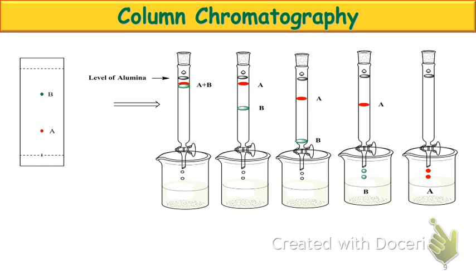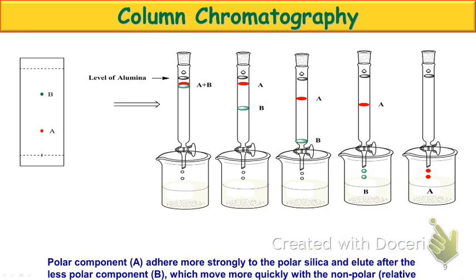So if we now switch this around and look at a time-lapse photography of what's going on with this. We've got our TLC plate on the left, and then we've got our columns going on to our right. What can you tell me about compound B? It is the least polar because it has, what about its RF? It's the highest RF. Okay, so it's going to be our least polar. So if we now go back to our column and try and track down what's happening with that.